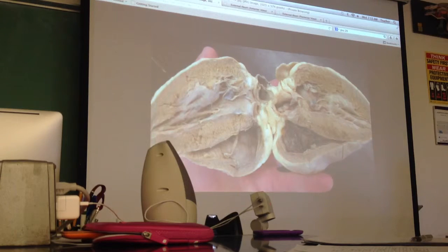Okay, now the other valve. If you cut it open all the way like this, which you can do, but I recommend doing it a little bit lower. So actually, you're just going to do the top of the heart first, so that you don't cut open the semilunar valves. Okay, because you want to maintain those. Remember, I said that the semilunar valves kind of look like little bubbles on bubble wrap. We have them surrounding this aorta right here. So this is basically a broken piece of bubble wrap that was a part of the semilunar valve.